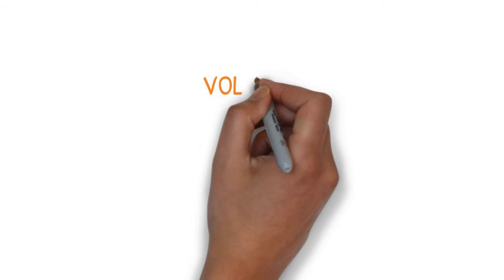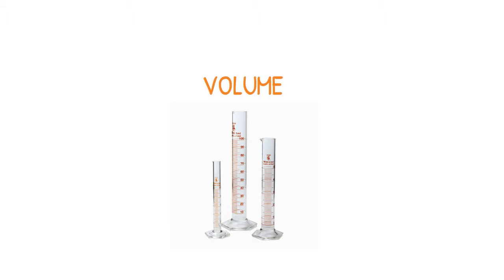The last graph is volume versus pressure. This graph is simple to obtain. The volumes of concentrate, condensate and evaporate are measured using a measuring cylinder. Repeat these steps to obtain the other three graphs for the effect of evaporator feed level. So, that is how we obtained the results. Now let's move on to the discussion part.